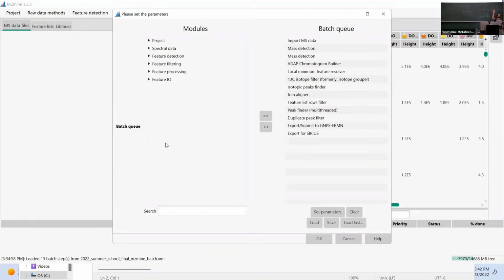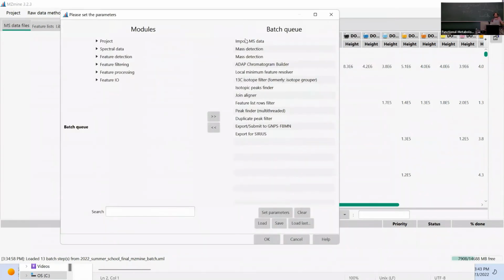Can I say one thing? Because many people have the same problems, I'm going to try to summarize the conversation so that everyone knows where the problems are. Usually, all this complex clicking that we did, we usually don't do. We usually jump directly into the batch mode. So did everyone manage to at least download the batch file from the Tuesday folder, go on load, and have it like this now?